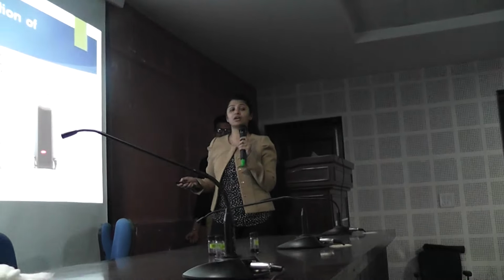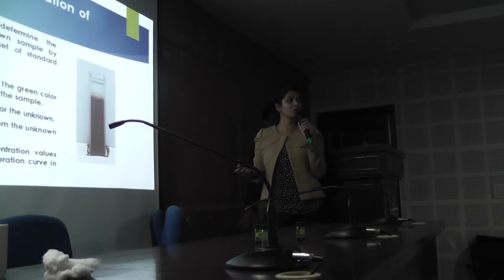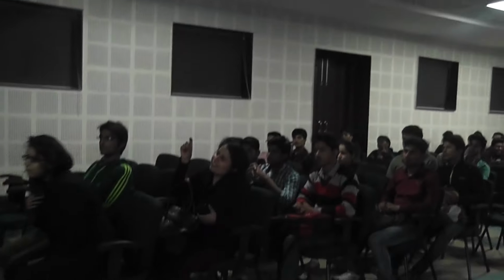Again we are going to take 3 locations, and from the 3 locations we are going to calculate. We can measure the intensity using the Google color picker app. And from those 3 values, we can again get the average value. How are you calculating that intensity?